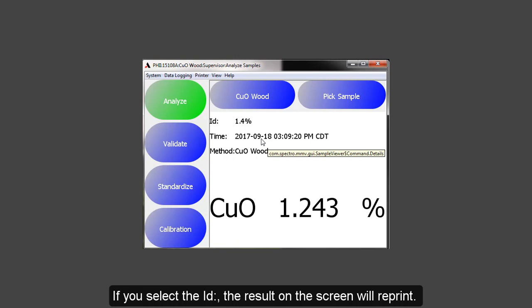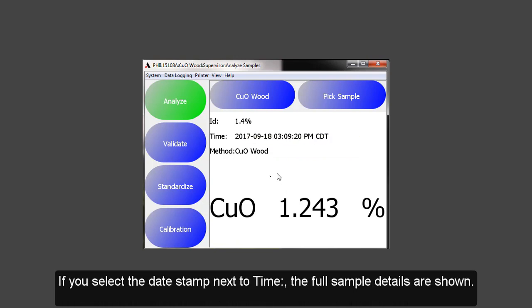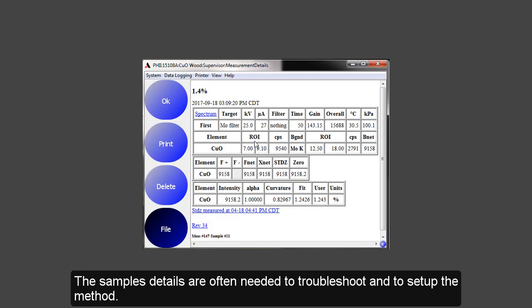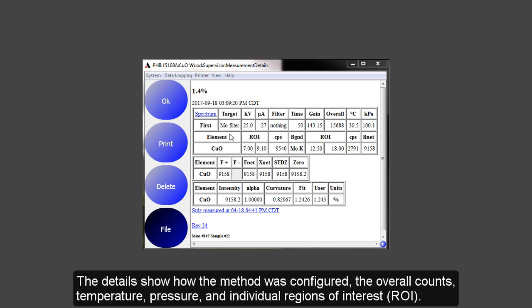To reprint the sample, select the sample ID. To see the spectra details, select the date timestamp next to the word time. The sample details are often needed to troubleshoot and to set up the method. The details show how the method was configured, the overall counts, the temperature and pressure, and the individual regions of interest for the element, or ROI.